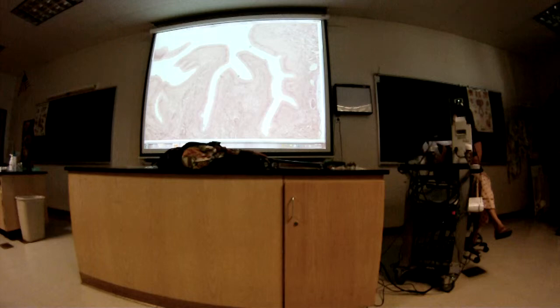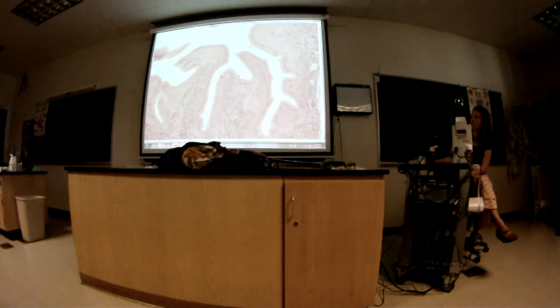Any questions about that one? I think that's our last one. You said mucosa or submucosa for the transitional and the lamina propria? The transitional epithelium and the lamina propria are the mucosa. Mucosa.